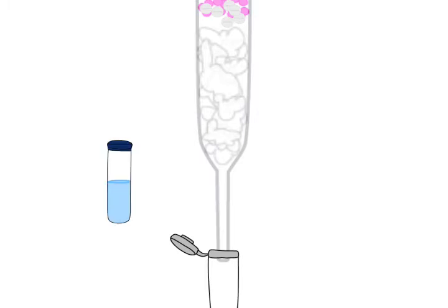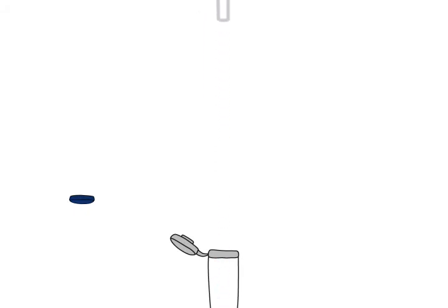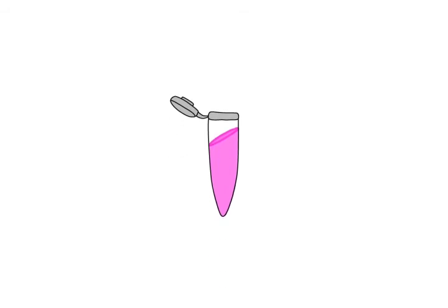Elution buffer, which contains imidazole, will help isolate the fluorescent proteins directly. The imidazole from elution buffer will connect to the nickel beads and in turn replace the fluorescent proteins so that the fluorescent proteins will fall into the microtube. Now the fluorescent proteins are fully isolated.